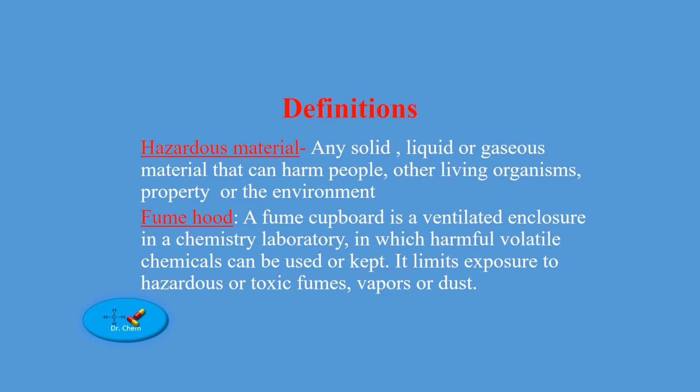What is hazardous material? This is any solid, liquid or gaseous material that can harm people, other living organisms, property or the environment. Within a chemical laboratory setup, we encounter these hazardous materials in the form of chemicals. We are expected to handle these chemicals carefully, and that's why we require a fume hood.